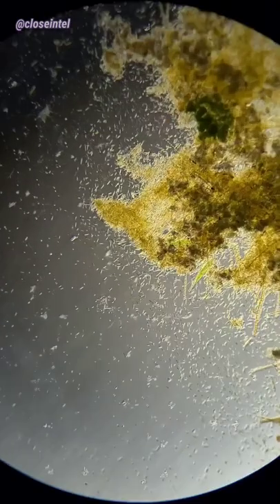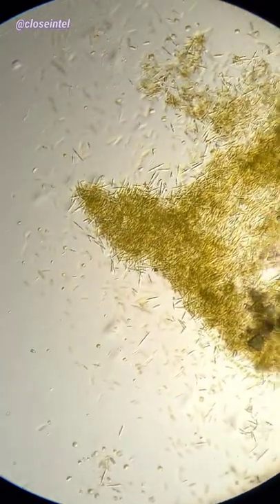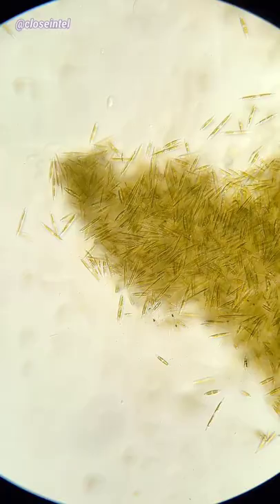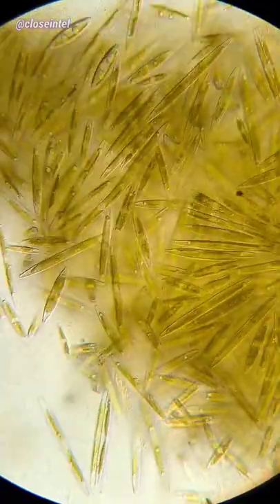At first you should see this yellowish-brown substance, but once you zoom in, you'll actually notice that that's the colony of the diatoms. Zooming in even further reveals the extremely fine details of the diatom casings. This clip is at 600x at around 8x speed.